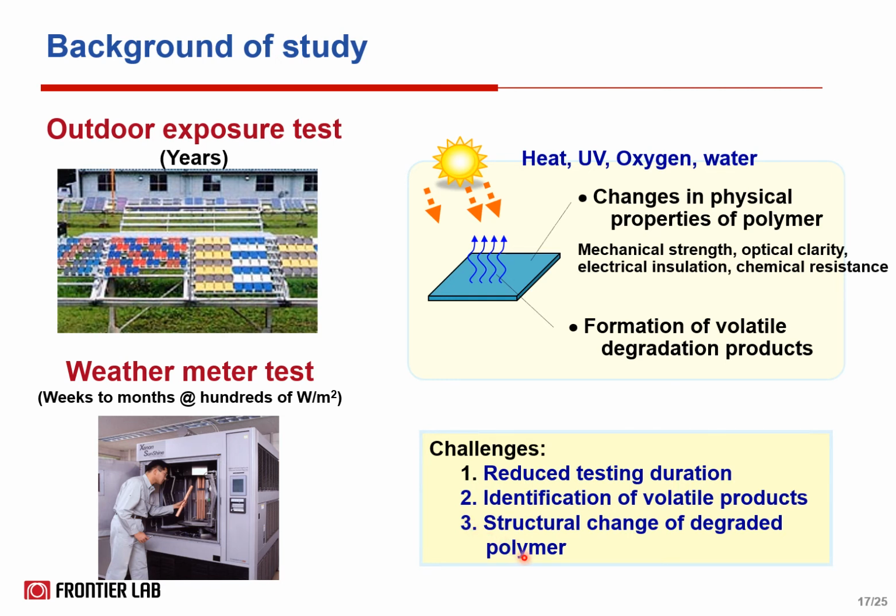So to overcome these challenges, we developed online UV irradiation pyrolysis GCMS, or UV Py-GCMS system, to complement the conventional tests. In this talk, we use the system to study the photo, thermal, and oxidative degradation of EPDM sample.